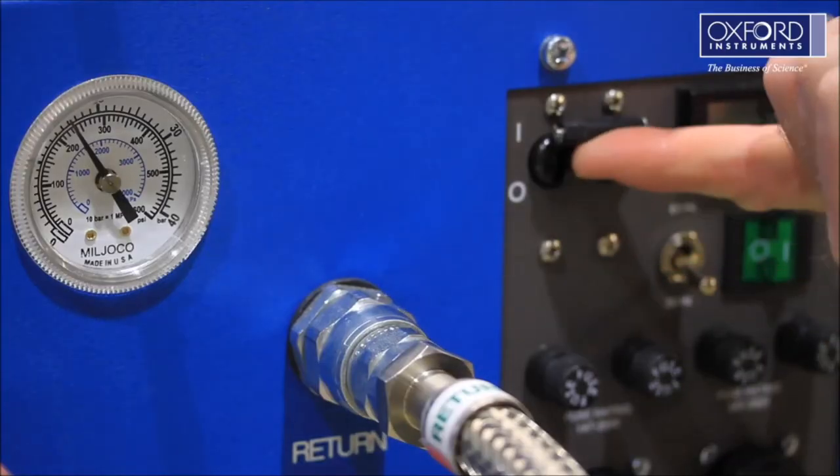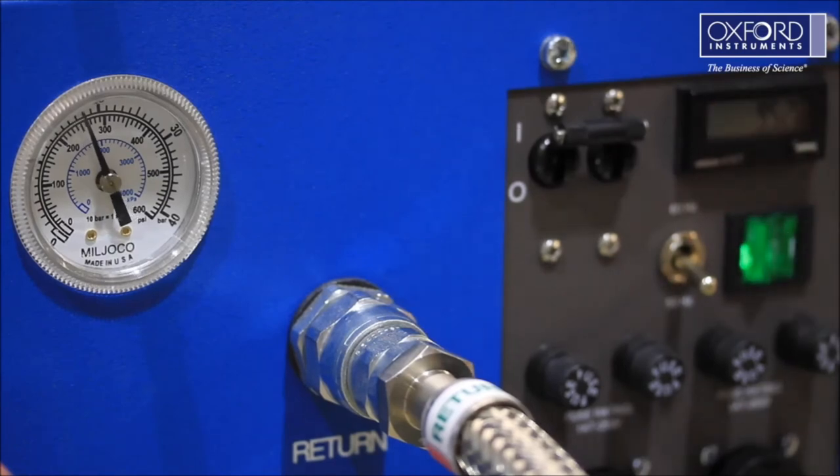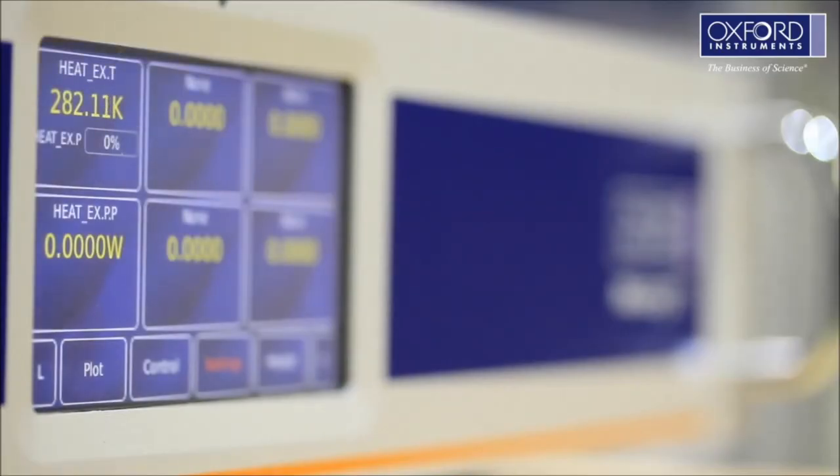Start the compressor and the cryostat will begin cooling. Check the cryostat reaches base temperature as per your system test datasheet. Leave the cryostat at base temperature for approximately 1 hour.